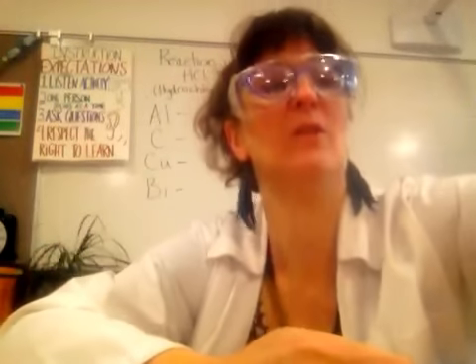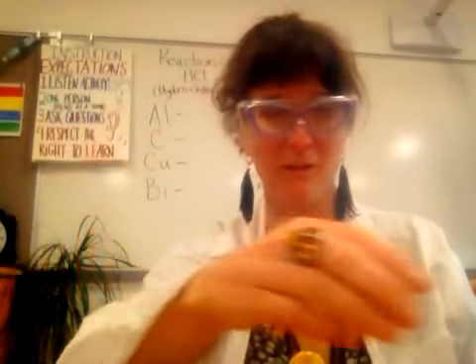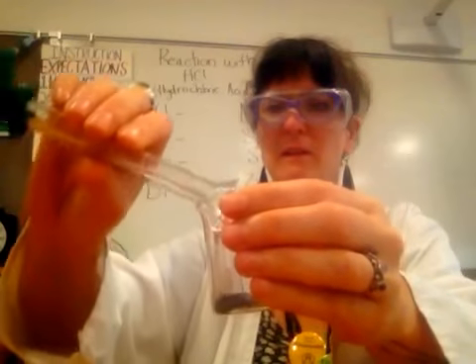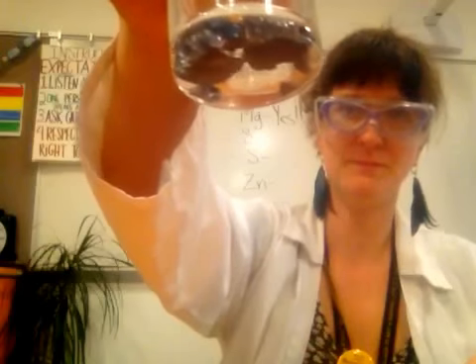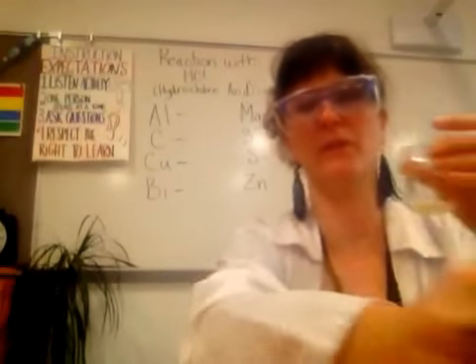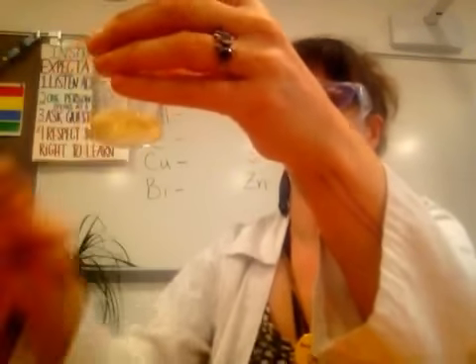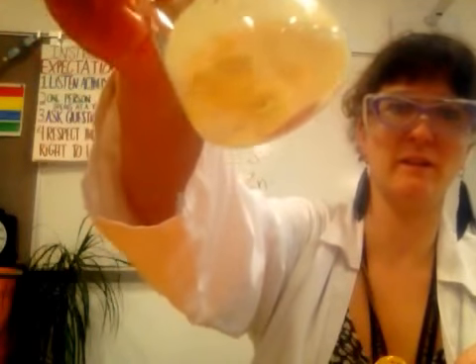All right. So magnesium's still reacting there. You might hear a little bit of the fizzing happening. So I'm going to take, here's the silicone. It kind of looks like a sparkly black substance. I'm going to add again some hydrochloric acid here. Alright, then we've got sulfur. That was the yellow, a little bit smelly powder. Alright, so trying to react that with the hydrochloric acid.